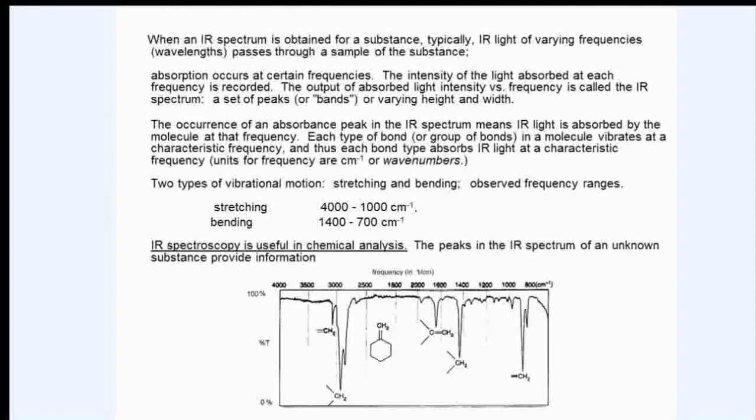Moving further to the right, the next peak we come to, the functional group creating it is indicated. It's a CC double bond in the molecule. The CC double bond stretching vibration, absorbing its corresponding photon, creates that peak. It's about 1640 units, it looks like.